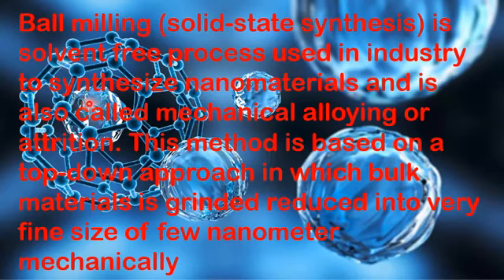So, dear student, why is the ball milling method known as a solid state synthesis method? The reason is quite simple. The material used in the ball milling method is in the form of a solid bulk material.